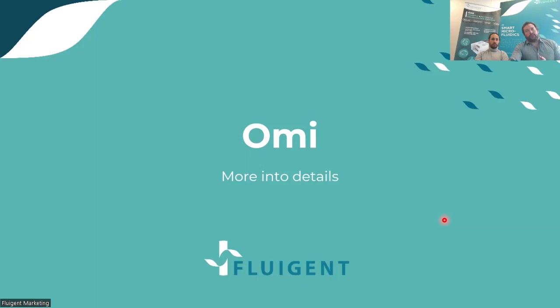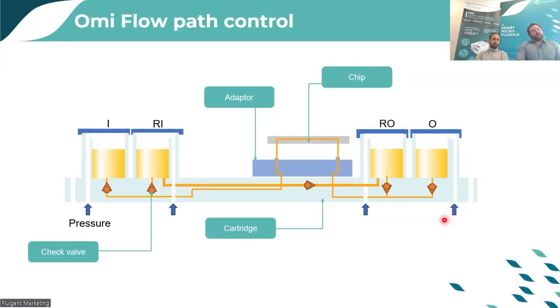Now I'll give you maybe more technical details. You don't necessarily need to know this, but for your understanding of the machine, we'll describe a bit more in detail how it works. Here you see a cross view of the cartridge with the 4 reservoirs. If you put the caps at the bottom, you have access to put pressure, basically.